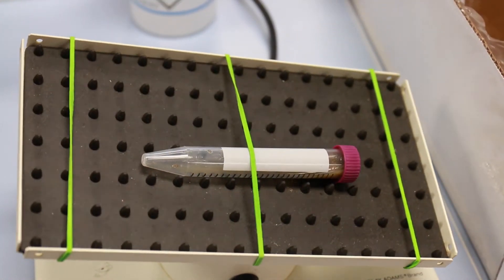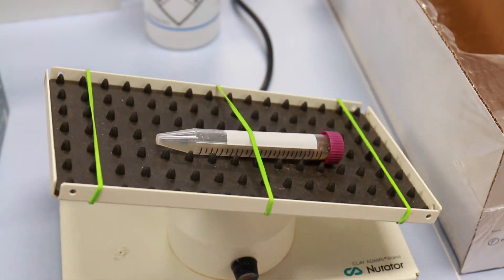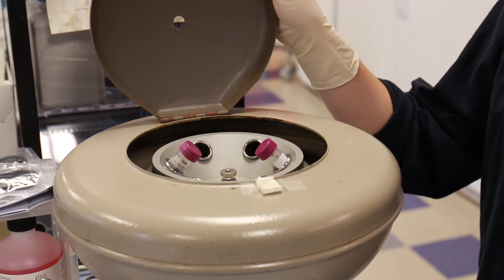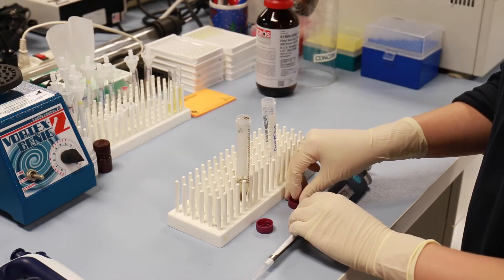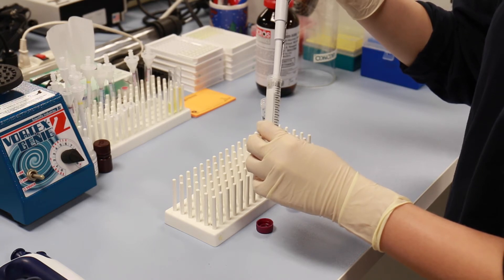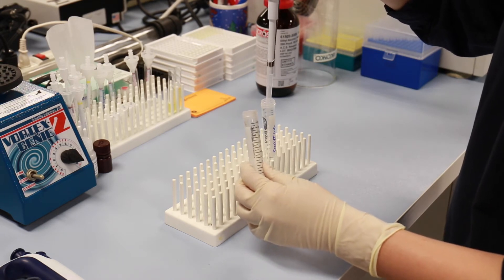Shake samples vigorously for at least 30 minutes or rotate overnight at room temperature. Centrifuge samples to pellet the solids. This can be done at 5000 rpm for samples less than 5 ml or at 1000 rpm for larger volumes. Carefully transfer the organic supernatant to a clean sealable tube. Note this can be a stopping point — simply seal your organic supernatant samples and place them at minus 20 degrees centigrade.